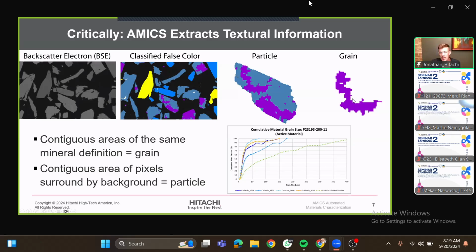In this case, we're looking at grain size in microns. And so you can see we've got several samples. And this really illustrates the power of this, because we can see when our process is creating particles or acting upon particles, we can compare the process inputs and outputs, and understand that process better.